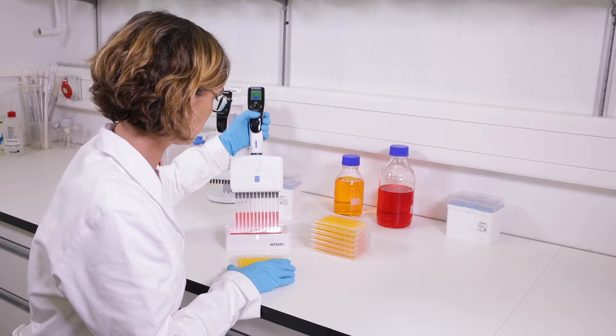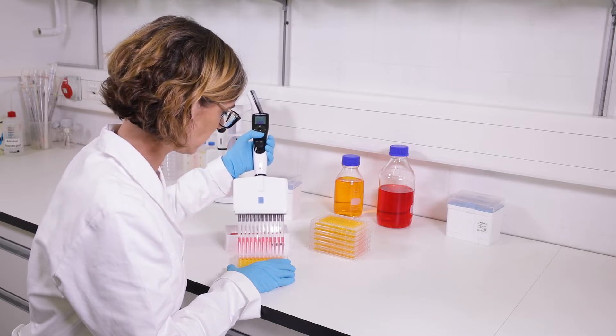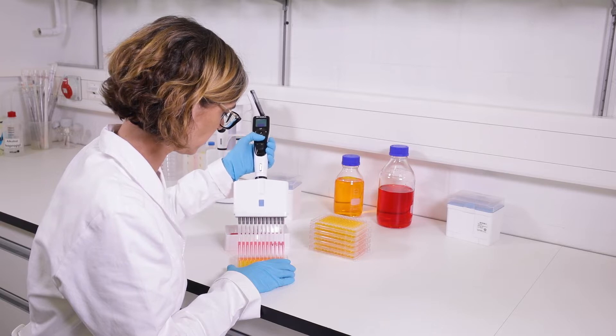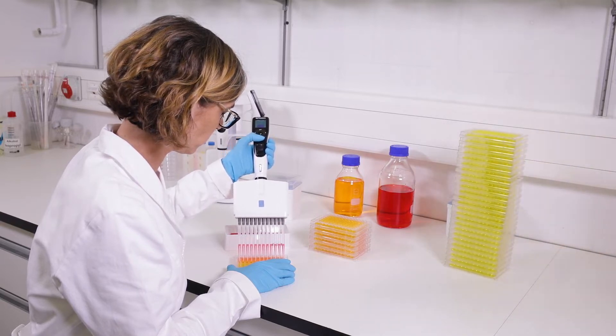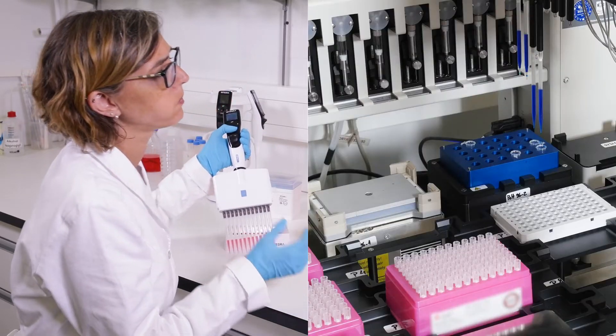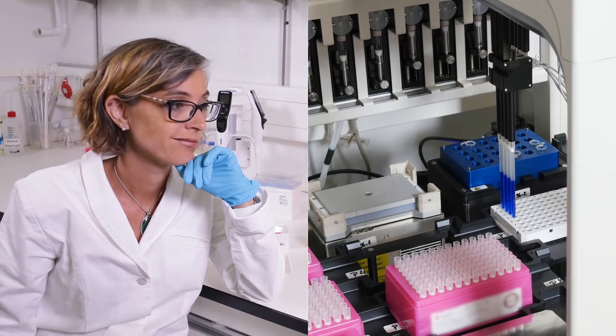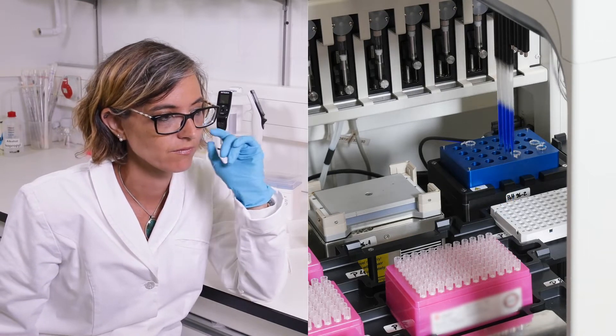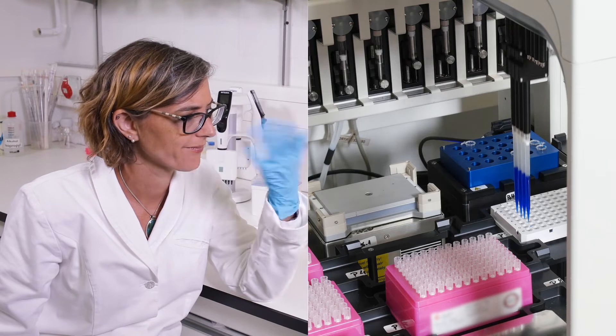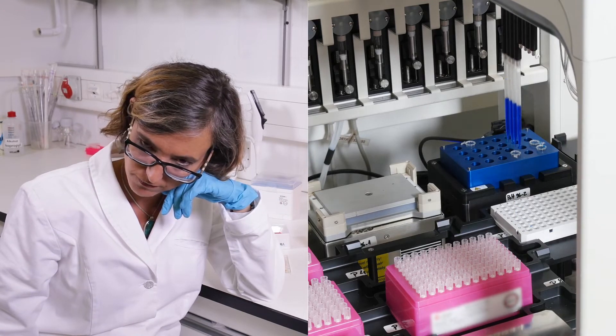Multi-channel pipettes are great tools for pipetting small to medium quantities of plates. However, what can you do when faced with an ever-increasing workload? High-throughput robotic systems exist, but they are associated with high costs and require long training and setup time. Is there anything which combines handheld pipettes' ease of use together with the throughput of robotic systems?